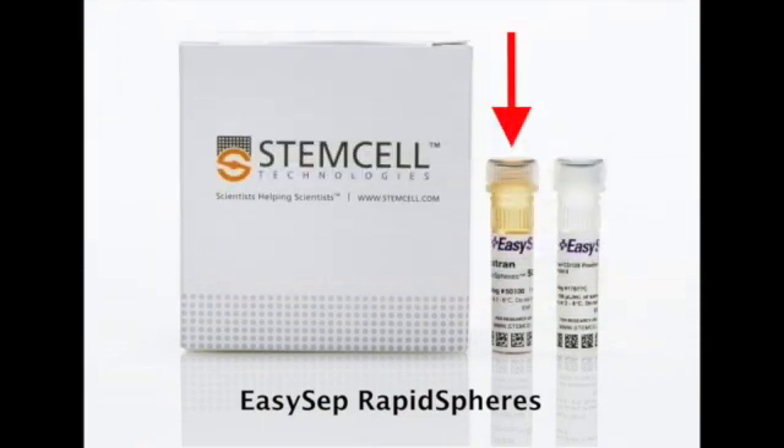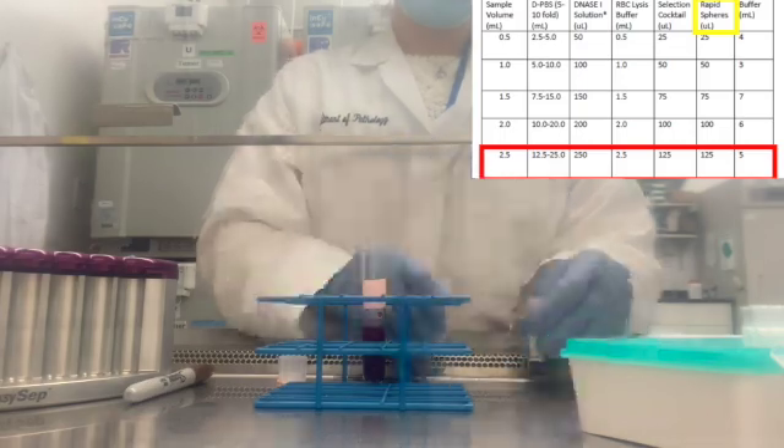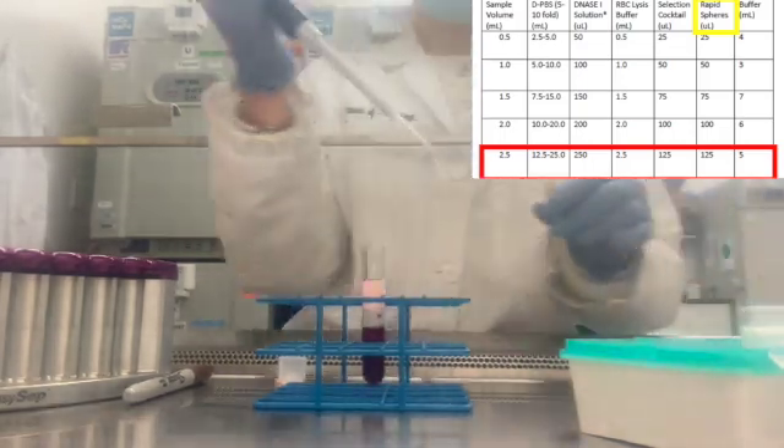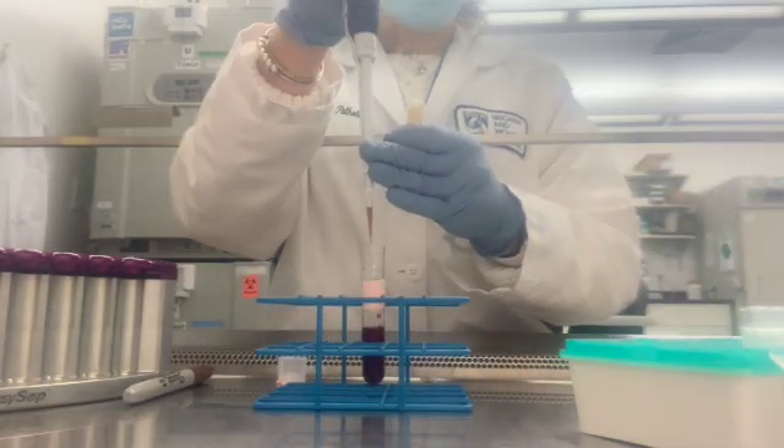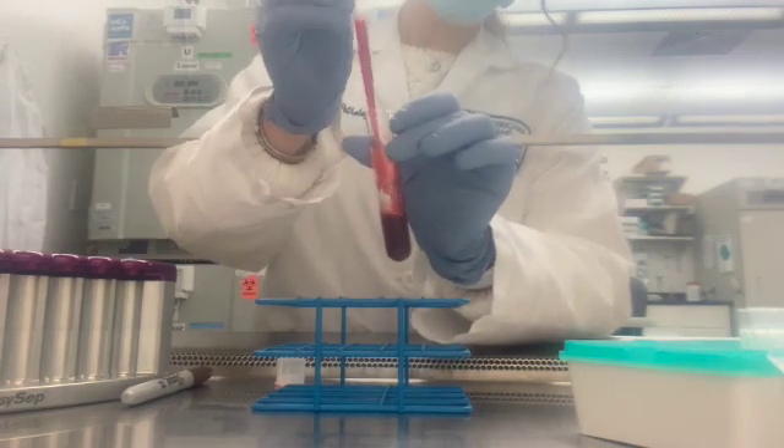Next, you will be adding the EasySep dextran rapid spheres. This cocktail has a brownish tint and appears to have a coffee grain sediment at the bottom when unmixed. To ensure proper distribution of particles, vortex the rapid spheres for 30 seconds. Once your timer runs out, uncap your sample and add the rapid spheres using the same volume as the positive selection cocktail. Gently mix your sample and set a timer for 3 minutes.